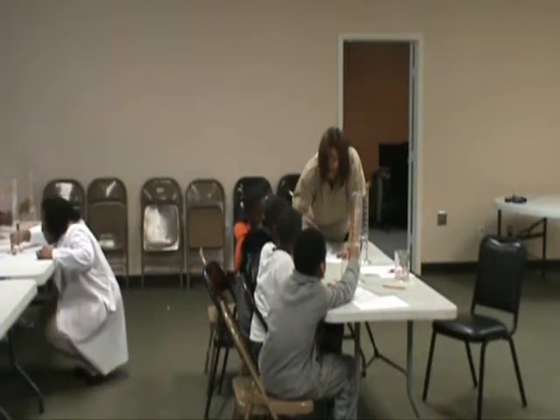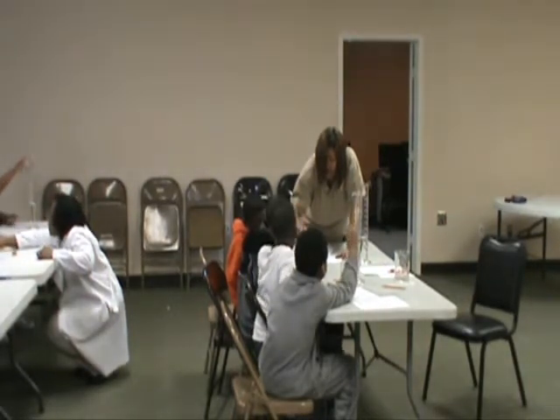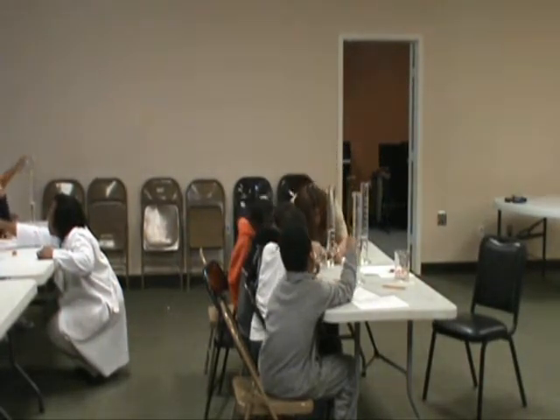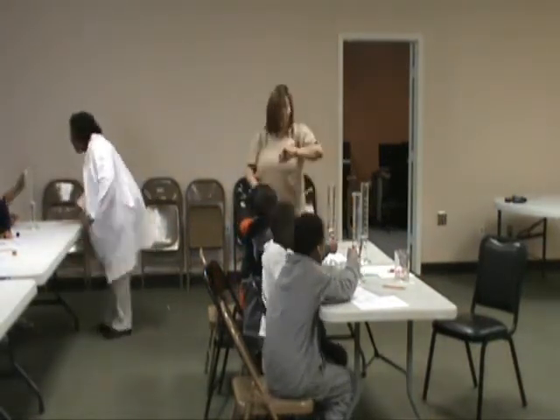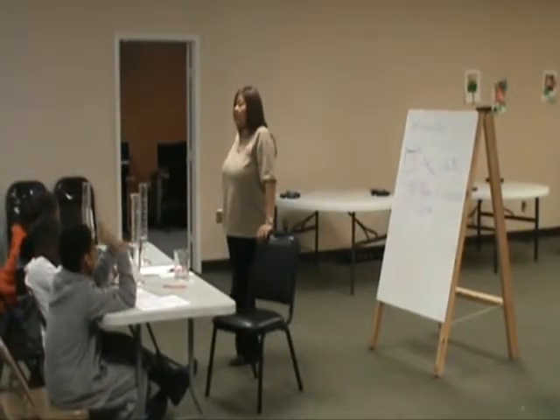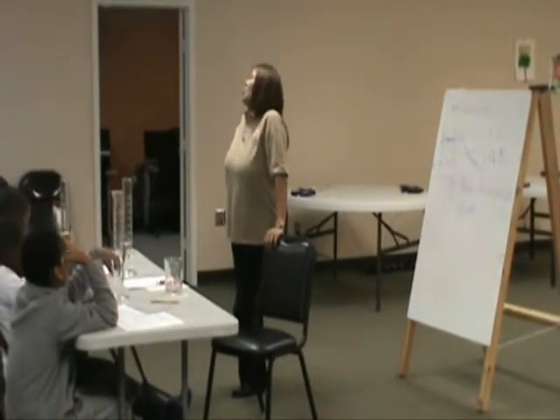Look. We're just going to be real patient, and we're going to pour a very, very small amount. Right? There. Now, let's see what we have. Get your air bubbles out of here. You've got to do it again. Now you're going to pour a small amount. Do it again. You're not perfect yet. Okay, how many milliliters do you have in your graduated cylinder? 250. Good.